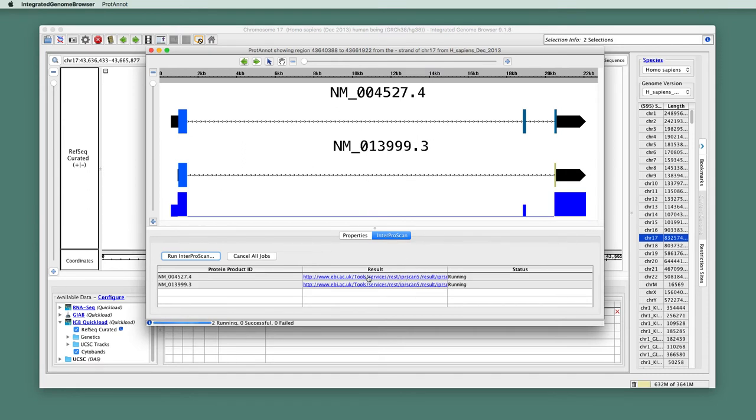And then what happens is ProtoNote sends a request to a server at the European Bioinformatics Institute and asks it to search the protein sequences for the gene models against the libraries that I selected or that were selected for me in the previous step.